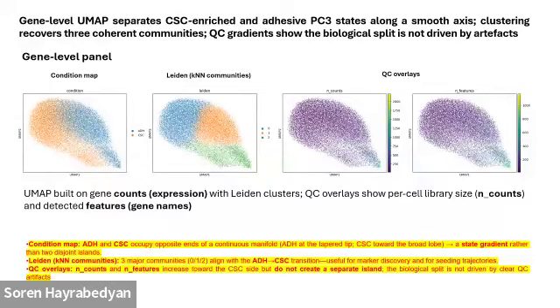They show, as I explained to you, that you have a multidimensional matrix per each cell. So for each cell, you have a number of the cell, like the barcode, and then you have different genes with their expression levels. What you need is to make this information 2D in order for a human to comprehend.